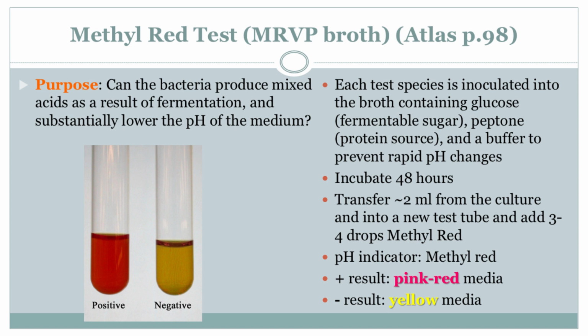It's actually crucial. The buffer helps keep the broth's pH stable at the beginning. And that matters because we want to see if the bacteria themselves change the pH by producing acids as they do their thing and metabolize. The buffer lets us isolate the effects of the bacteria themselves on the pH. Ah, I get it. So we add the bacteria to this broth, and then what? We just let them hang out. Pretty much. We let them grow in the broth for 48 hours.